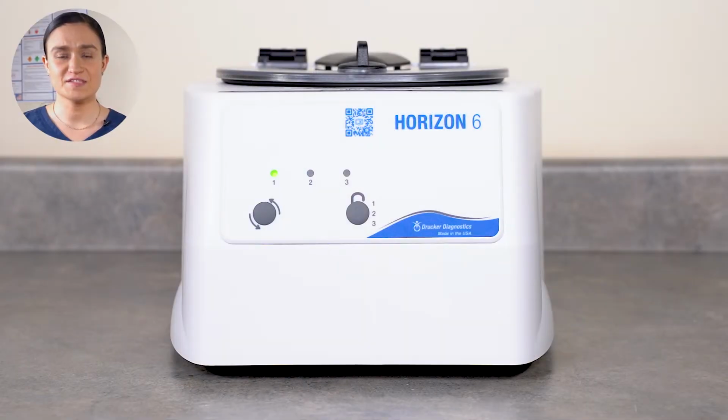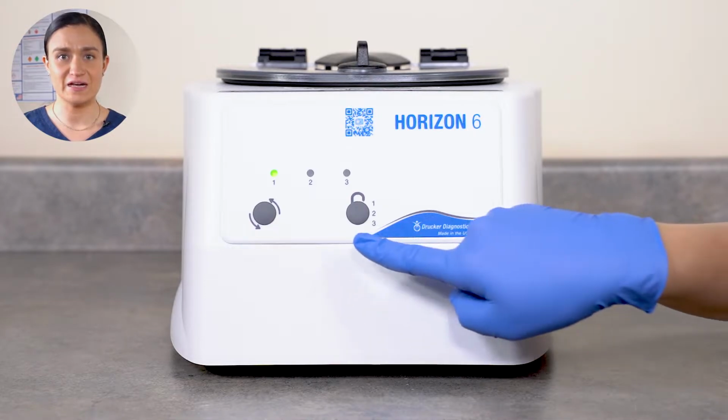Your Horizon 6 has a safety lock. The centrifuge will lock whenever the rotor is spinning and 60 seconds after a cycle has finished, and it will be locked when your centrifuge arrives from our factory. To unlock our centrifuge, we'll need to look at our control panel. To unlock the centrifuge, press the Stop Unlock button.